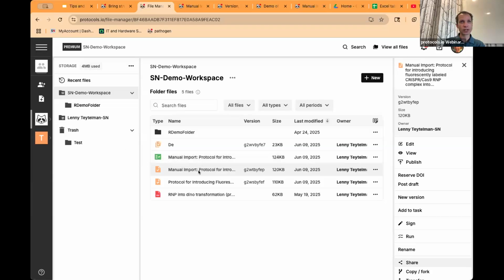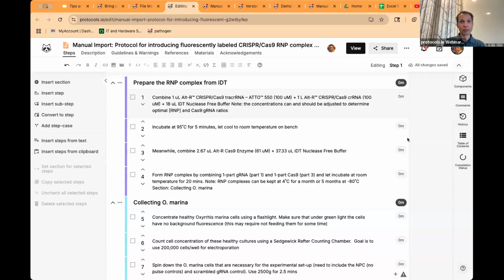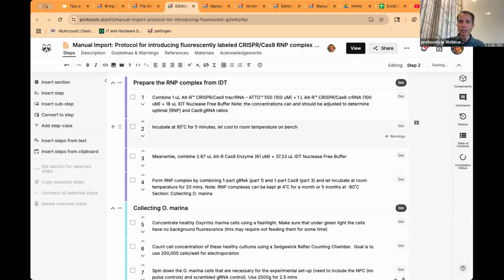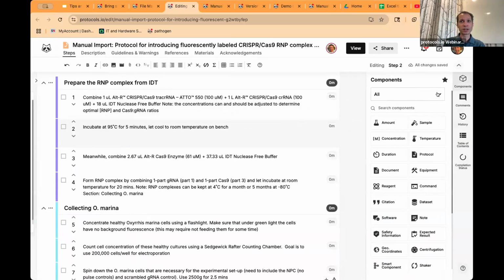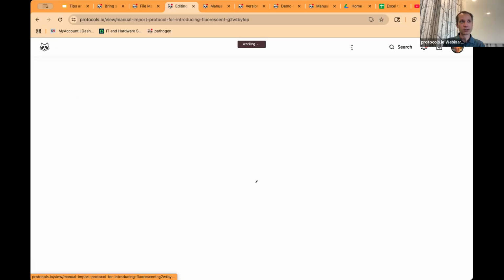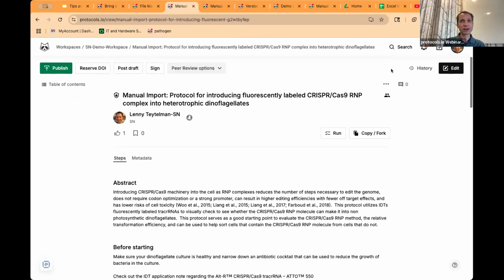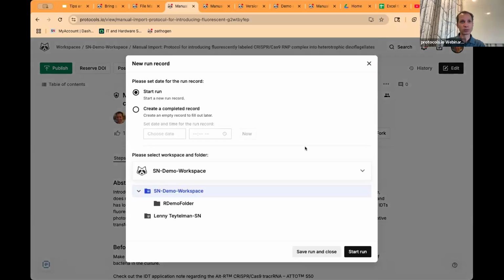It's not at runtime to be shared with other users, but one thing I didn't go over, let me show very quickly, is that there is a multiplier for components, not for tables, but if you're using components and amounts. So let's say amount is going to be 10 microliters, and this is double distilled water. So I have some components with amounts.